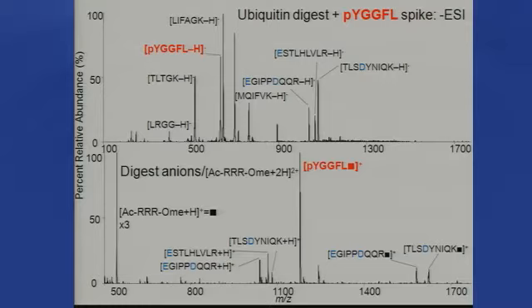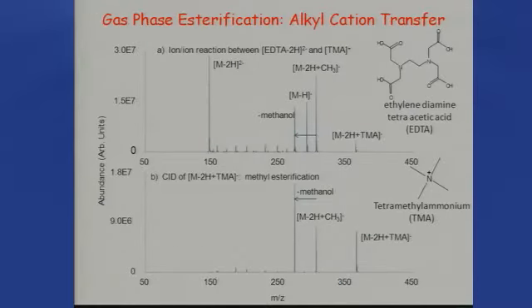And so it's really clear that we have enhanced this one. We're looking at tuning this a little bit better. We can also tune that Q3, Q2 voltage difference, and we think we can get some pretty good discrimination there. So we'll look at some more complicated mixtures with phosphopeptides. So that looks promising.